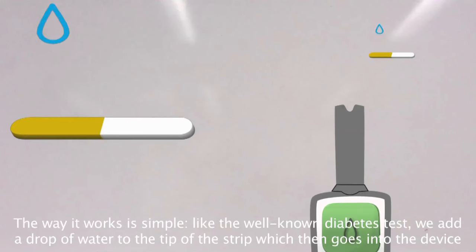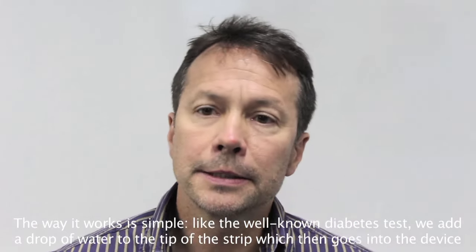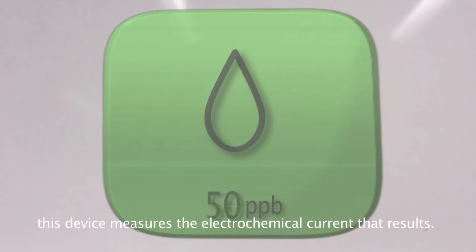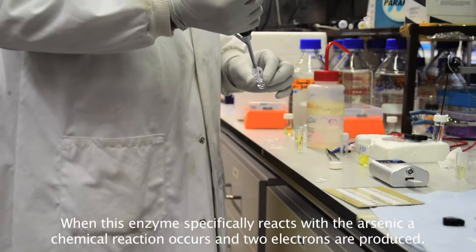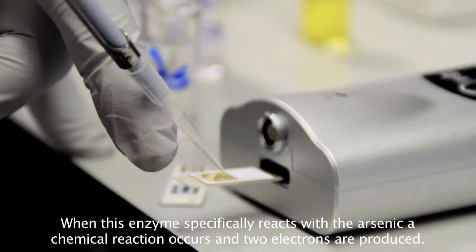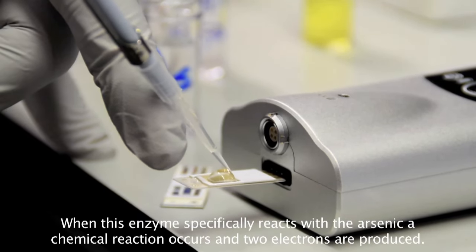The way it works is simple. Like the well-known diabetes test, we add a drop of water to the tip of the strip, which then goes into the device. This device measures the electrochemical current that results. When this enzyme specifically reacts with the arsenic, a chemical reaction occurs and two electrons are produced.